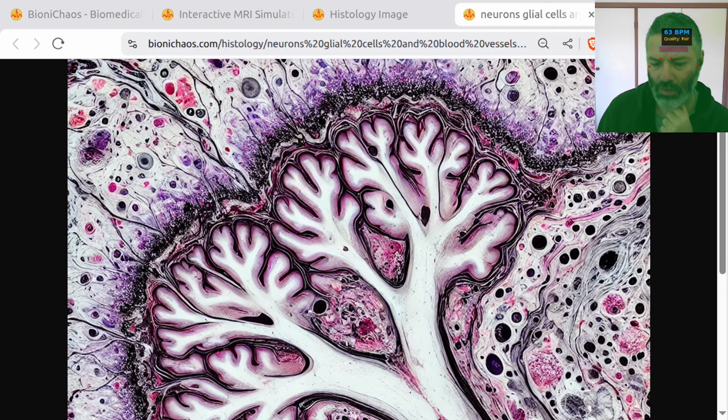Beyond segmentation and feature toggles, you can also implement a zoom and pan tool for navigation, an annotation feature to mark regions of interest, and a histogram or intensity control to analyze pixel distributions. Yes, cell counting is common, along with tissue classification, morphological measurements, and density analysis. You can also add co-localization analysis and morphological feature extraction.